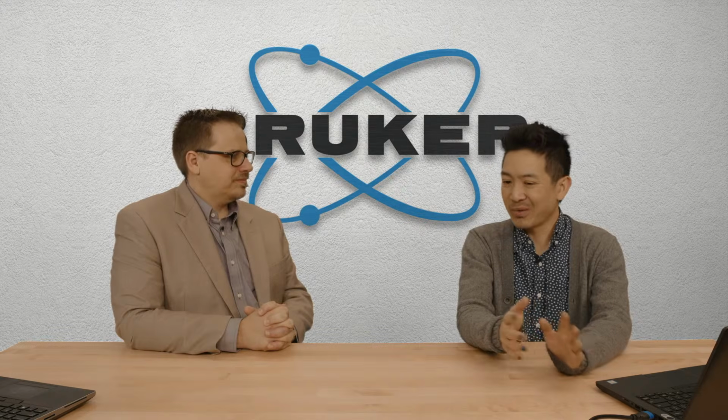There are moments, which I think is fascinating about my line of work, where on any given week I could be working with anyone. I could be working with someone in pharmaceuticals. I could be working with someone who is making confectionaries. I could be working with someone who works in a crime lab. And one of my favorite moments is whenever someone is looking at a piece of data and they go, aha, right? The aha moment.